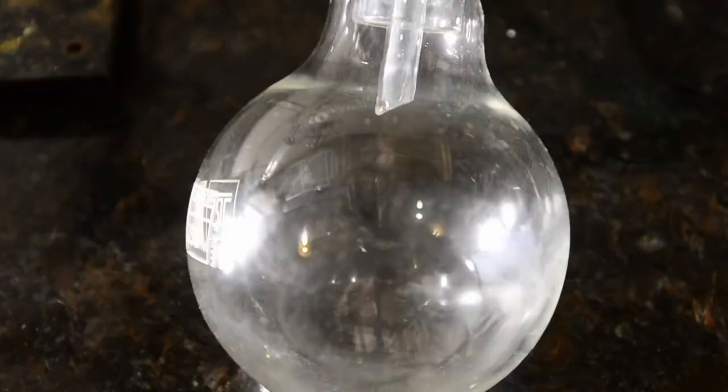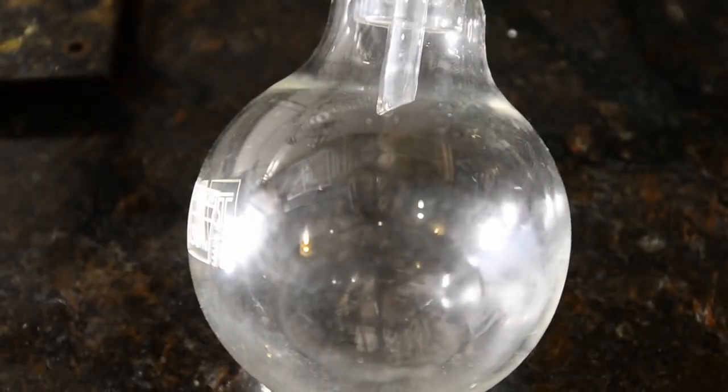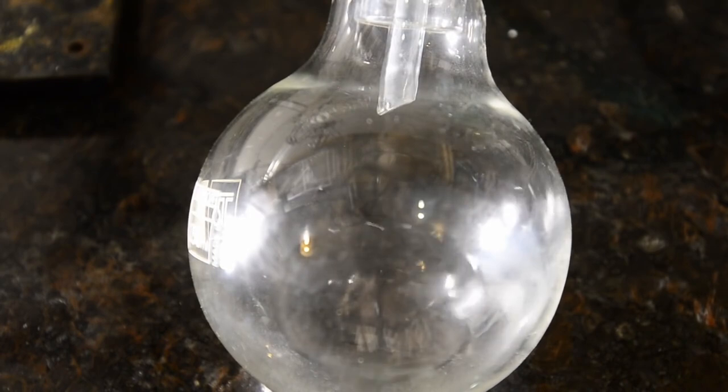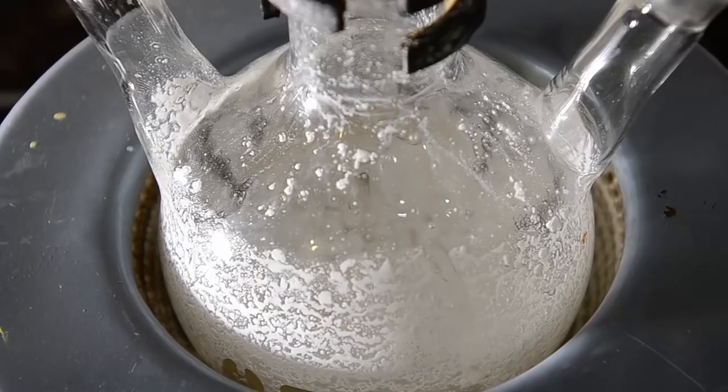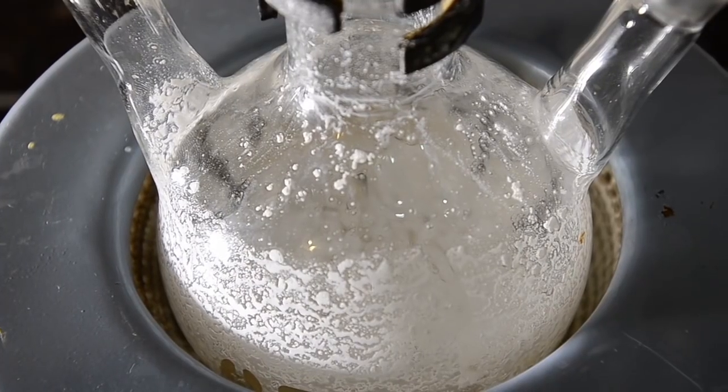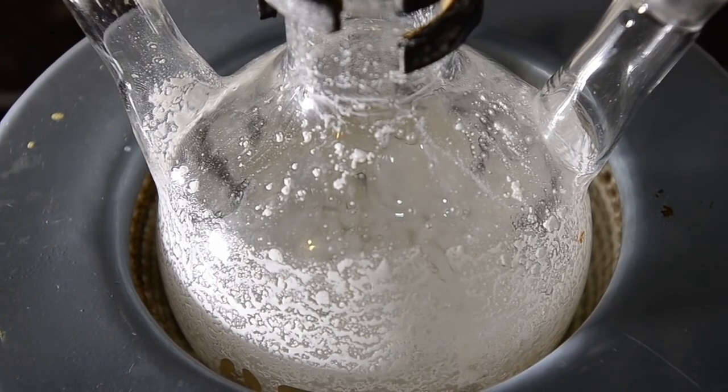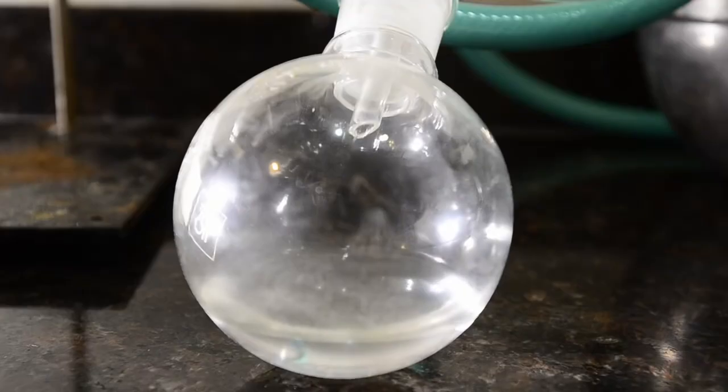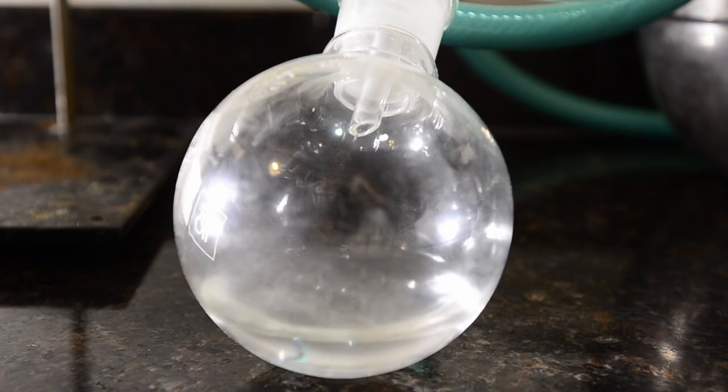Distillation is pretty rapid to begin with and slowly tails off but keeps going for quite a while. As distillation proceeds the slurry in the flask turns more and more solid. Quite a lot of liquid distills off, so don't stop the heat too early.